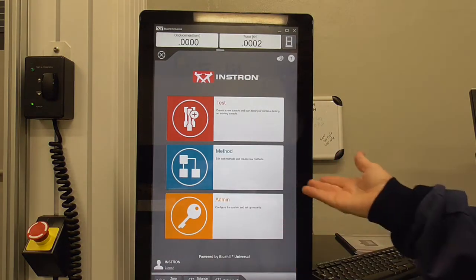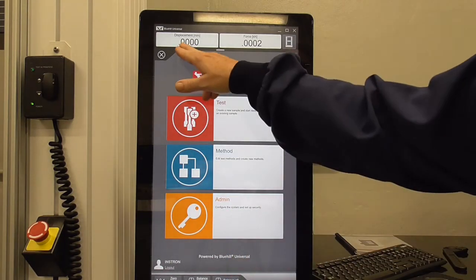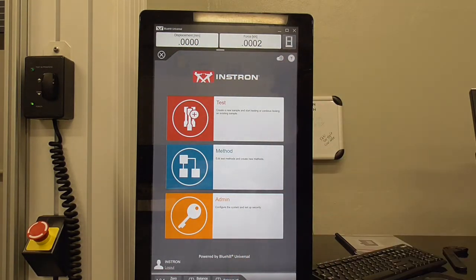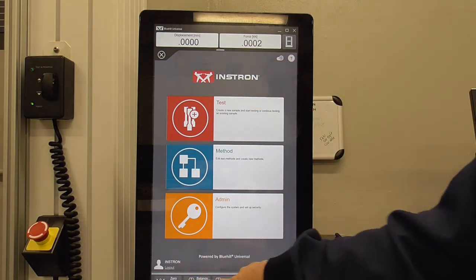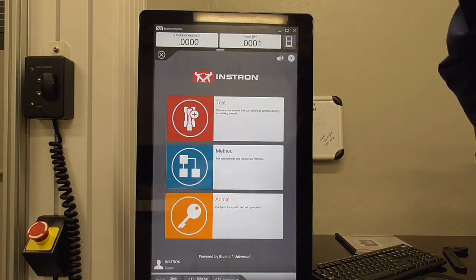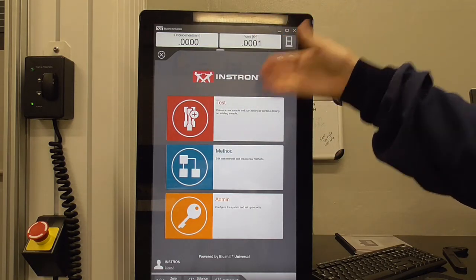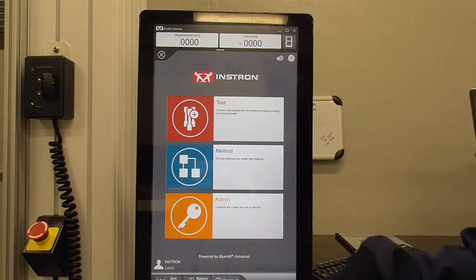We're back to the home screen. The displacement and force should be zero before you put your dog bone in. If not, hit 'balance all' down here and it'll zero these. You no longer need to calibrate the load cell each time, but you do need to zero it before inserting the dog bone.